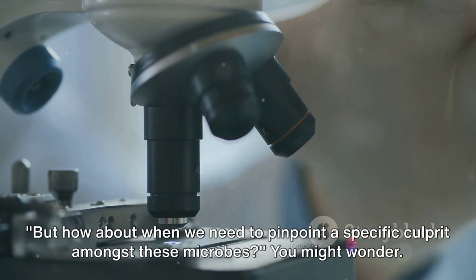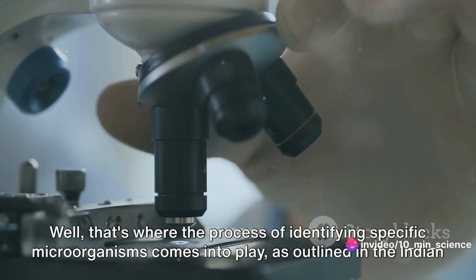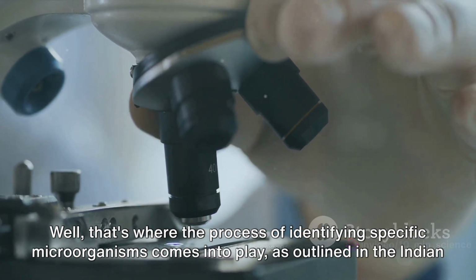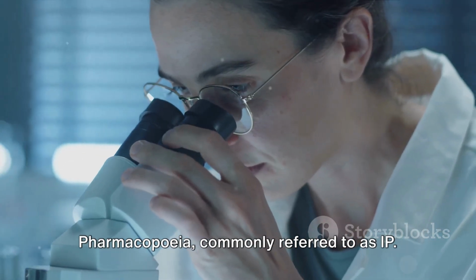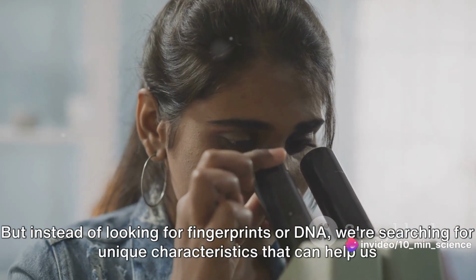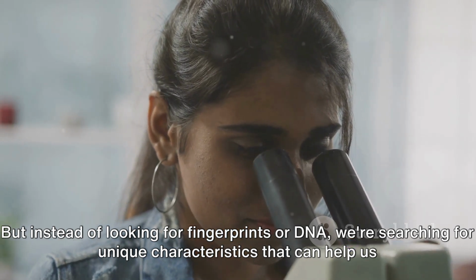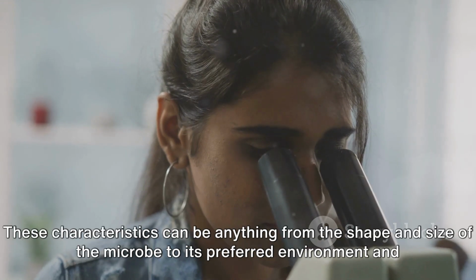But how about when we need to pinpoint a specific culprit amongst these microbes? You might wonder. Well, that's where the process of identifying specific microorganisms comes into play, as outlined in the Indian Pharmacopoeia, commonly referred to as IP. This process is akin to a detective scouring a crime scene for clues, but instead of looking for fingerprints or DNA, we're searching for unique characteristics that can help us identify our microbial suspects.